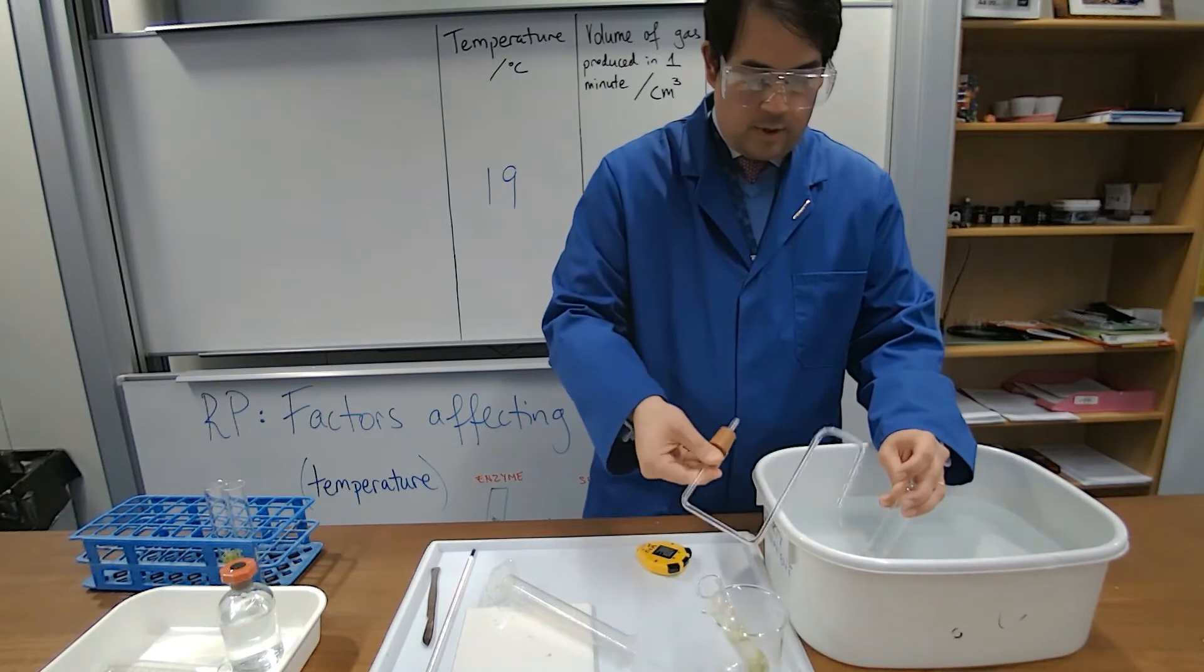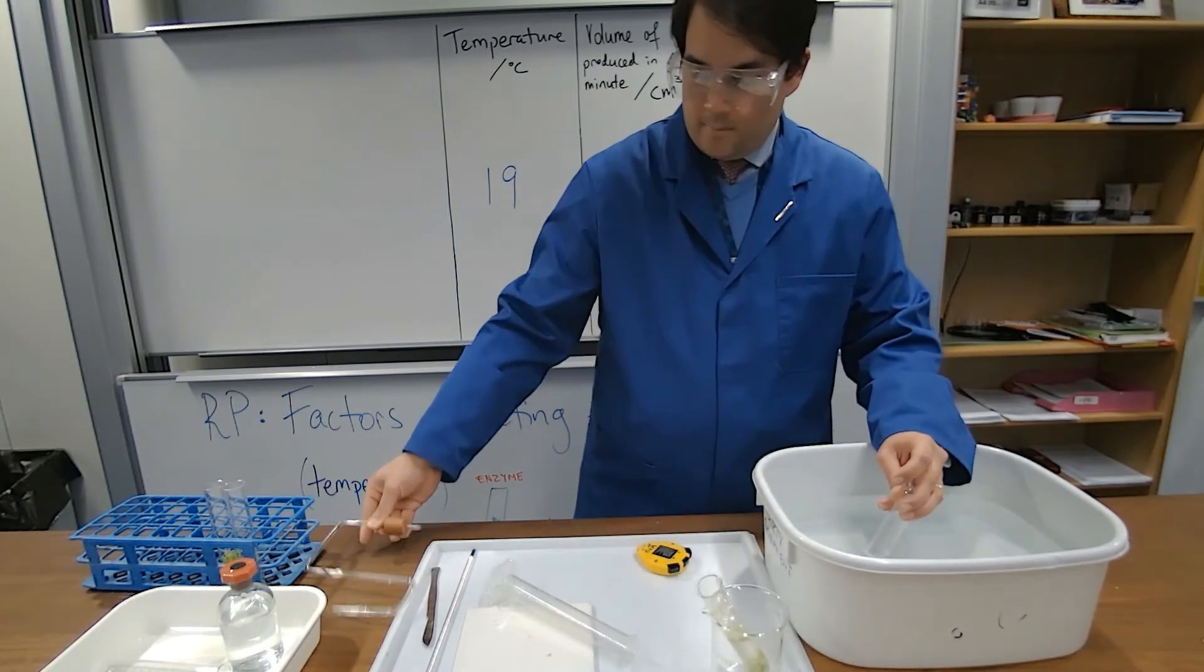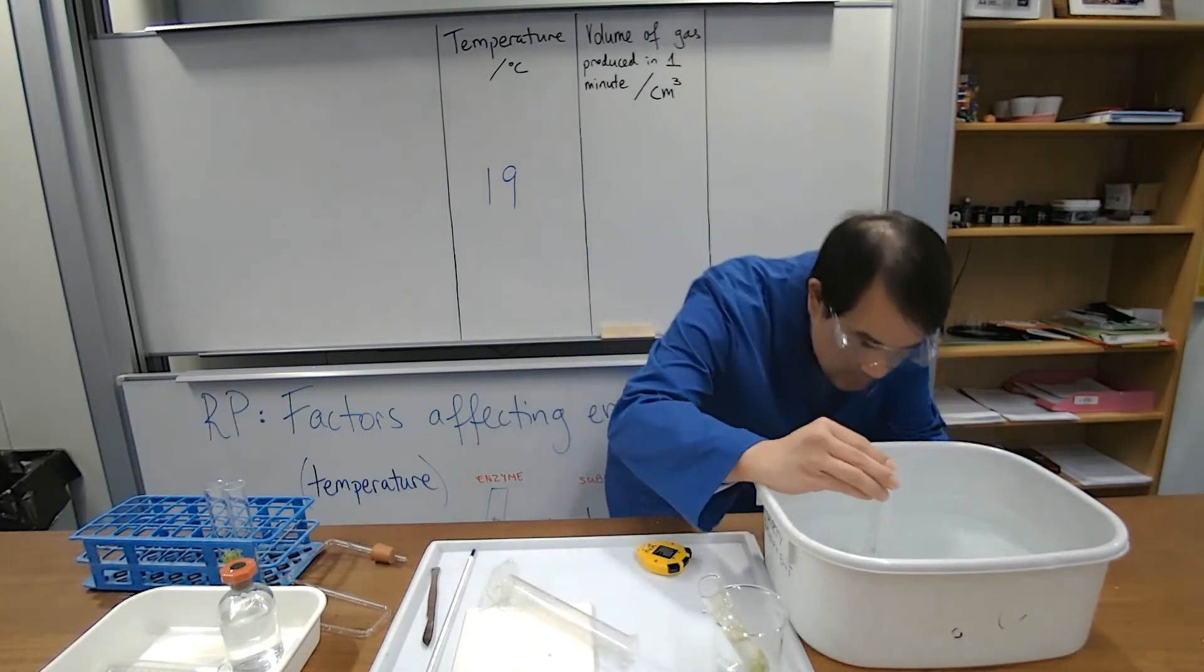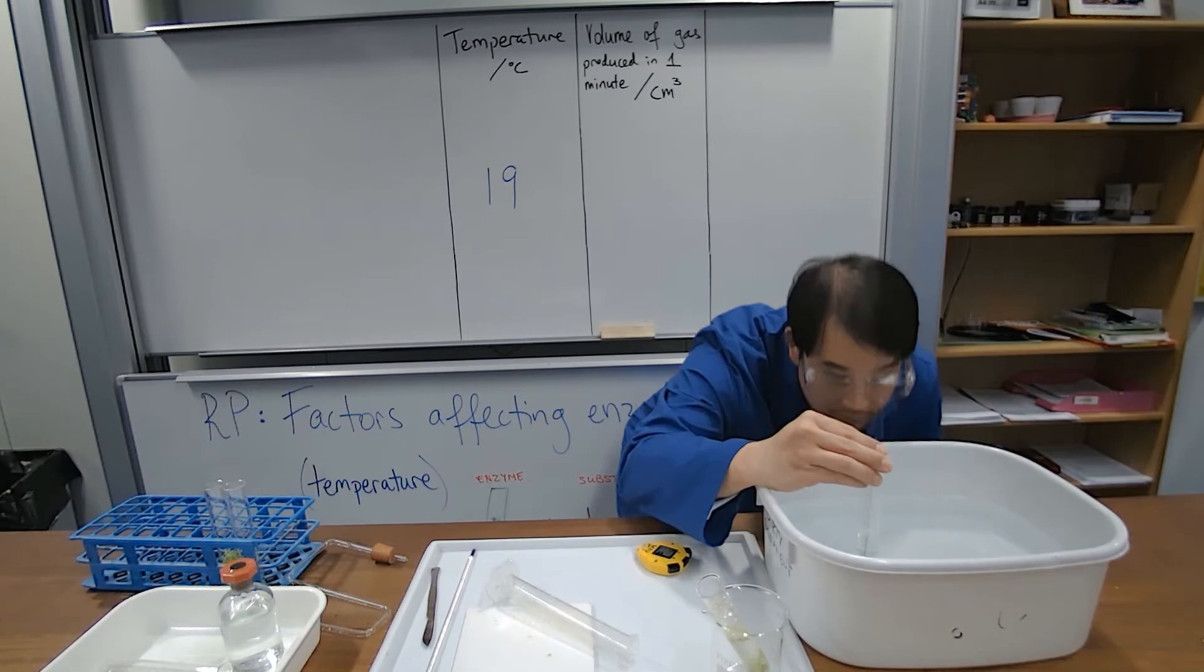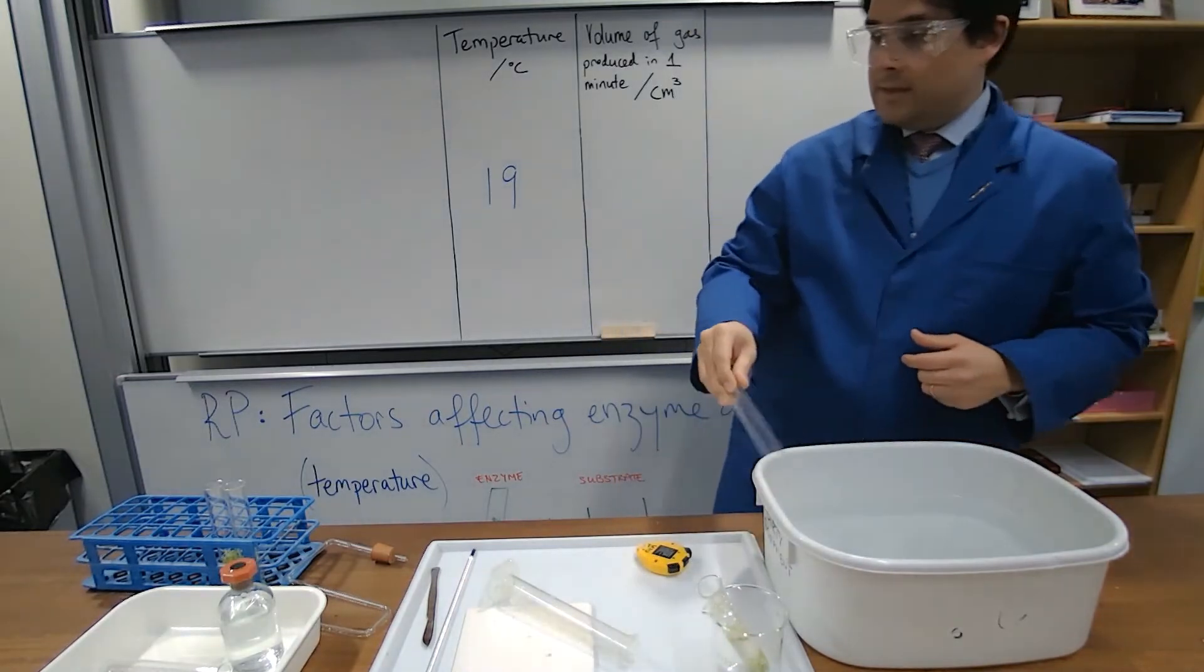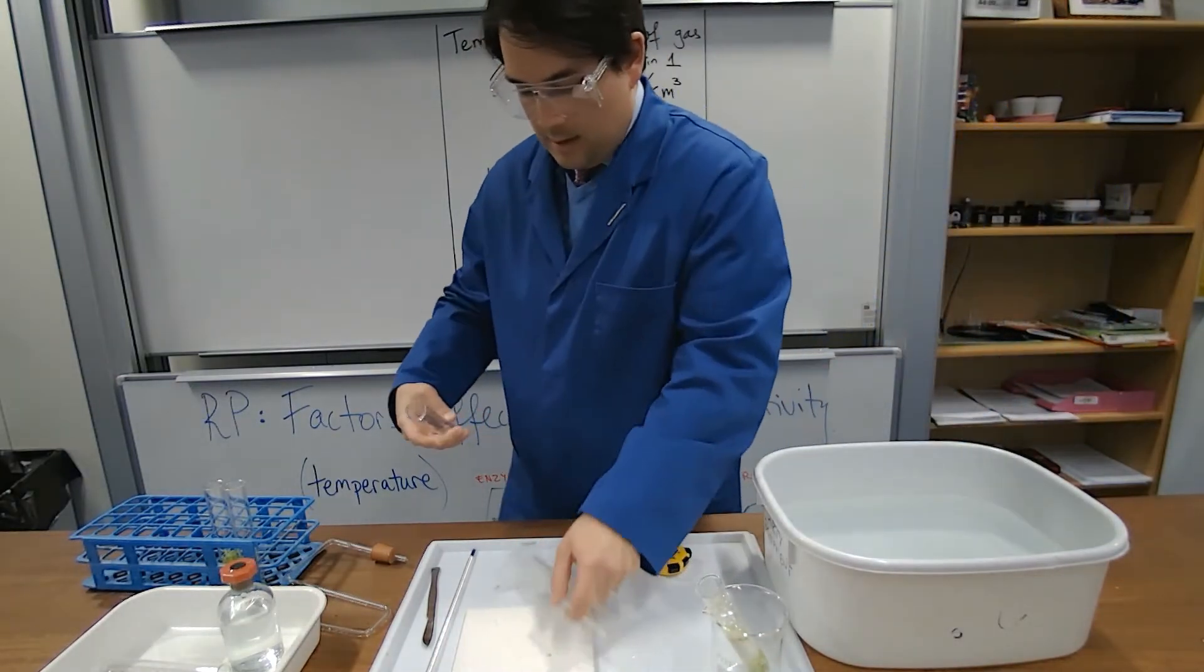Let's not shake it so much because then I'll be introducing a different variable. So, that's how much gas was released from that one. I'll say it is 10.7. So, that's that one done.